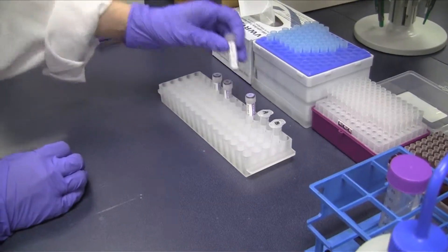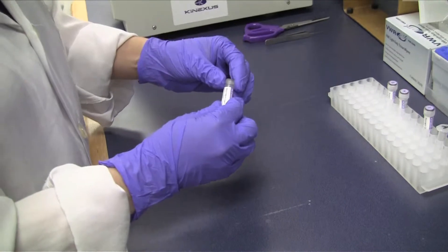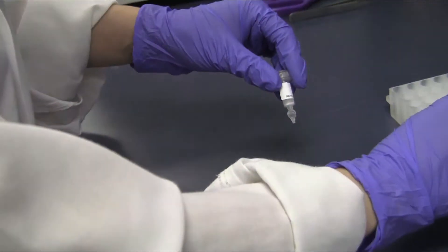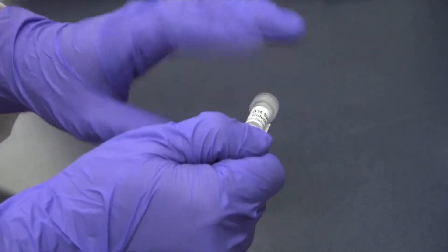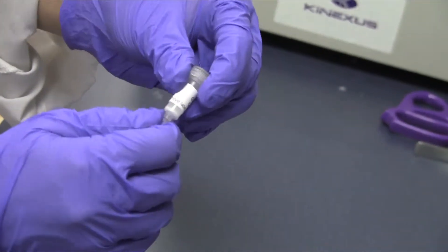Label the micro spin G25 columns part CAMI with corresponding sample IDs. Re-suspend resins in the columns by finger tapping. Loosen the cap and snap off the bottom closure.